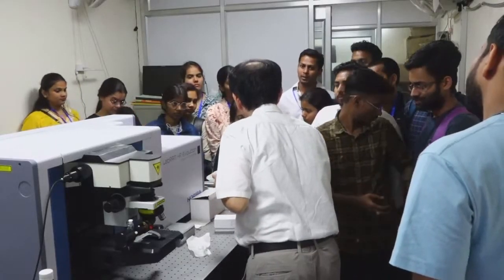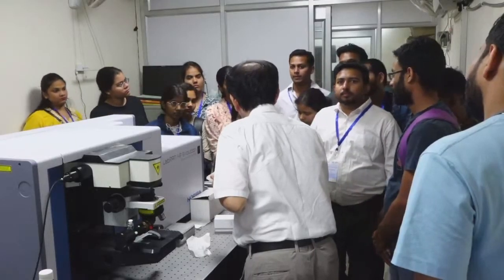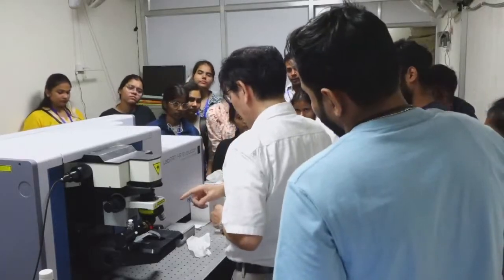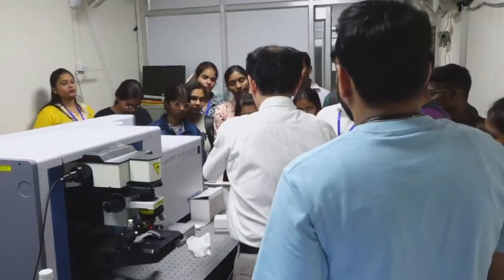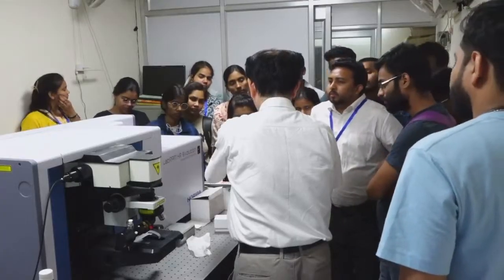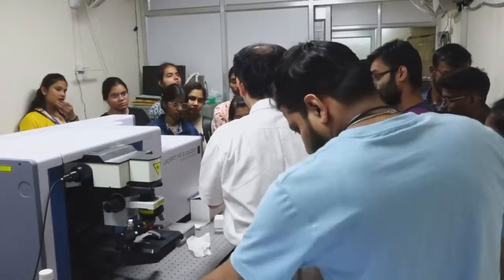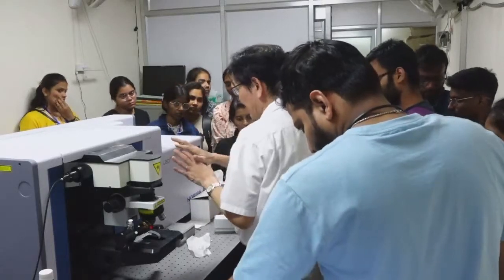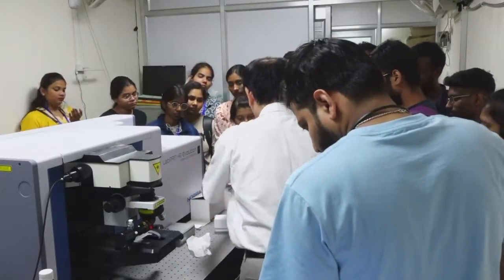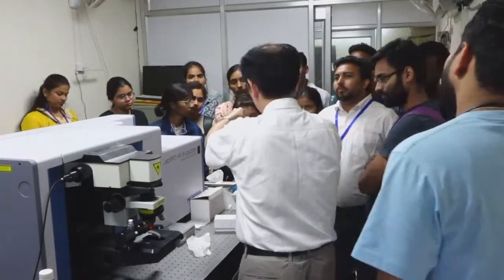So how can we analyze how much radiation is scattered from the sample? In this setup, all the signals come from the focal point, no other point. So all the detected signal comes from the sample. If the focal point is far from the good point, then it comes from air. So, nothing.